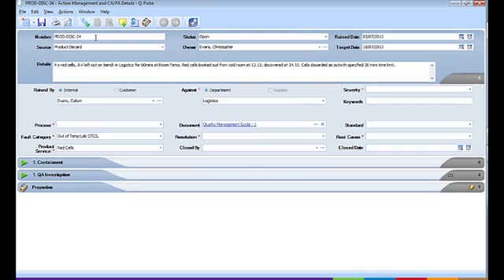We have a unique record identifier, we have a default status as open, the raised date has been pushed through, the type of issue has been recorded, and this is product discard. Ownership has been defaulted to a QA team member. We also have a defaulted target date. So immediately with these two fields populated, with the ownership and target date, the system is driving completion of this record through email reminders and also through user workload.